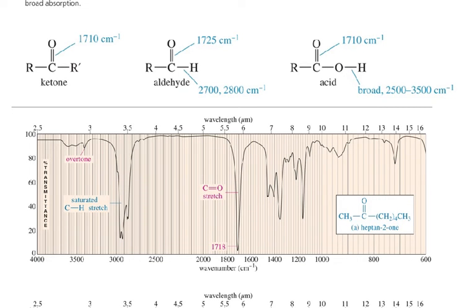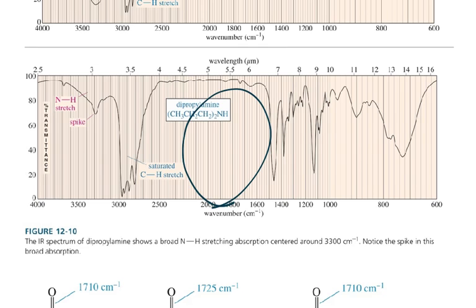So now we're going to look at carbonyls, and carbonyls are a very easy functional group to spot. Carbonyls are going to be around 1700. Sometimes they're shifted one way or another, depending on if it's an aldehyde or a ketone or if it's conjugated. But the carbonyl spike is going to look like that. And like back here when we saw a gaping hole there, that's how you know there's no carbonyl.